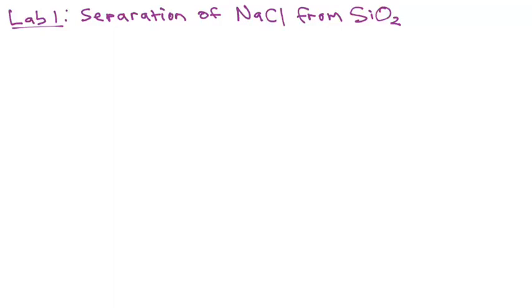This is going to be an in-depth video on all the information that's necessary to complete your first pre-lab. The lab that we're going to do first is the separation of sodium chloride, NaCl, from silicon dioxide, SiO2, also known as sand.